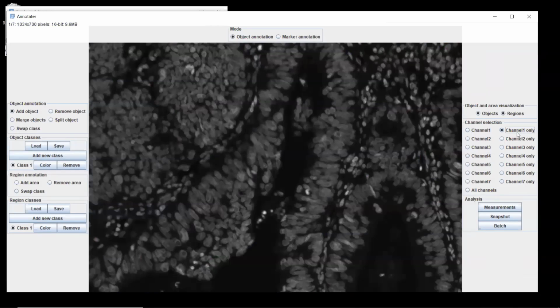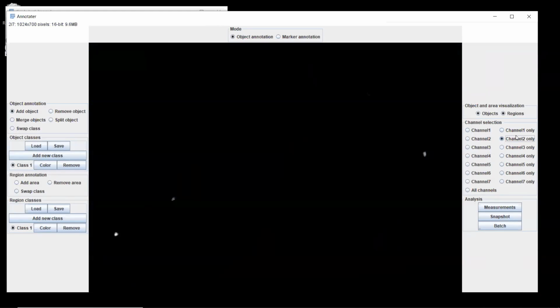Can I ask a question real quick? Sure. Is there a limit to the number of channels?